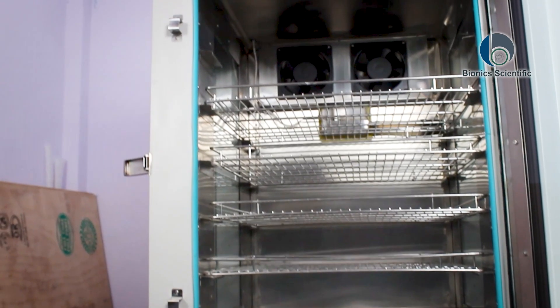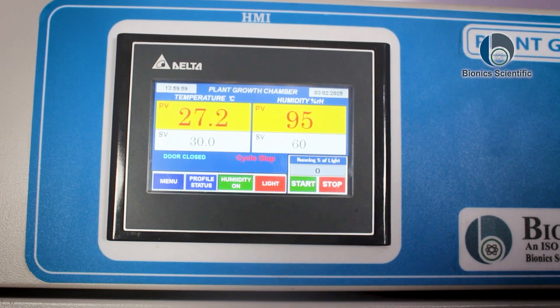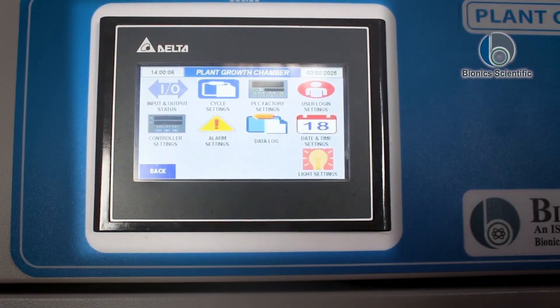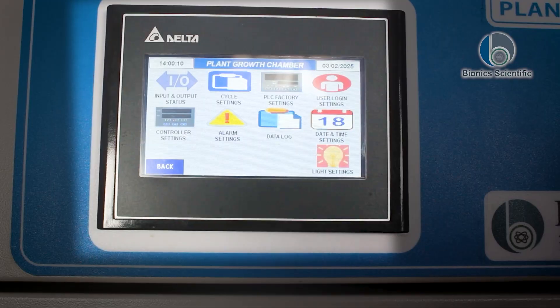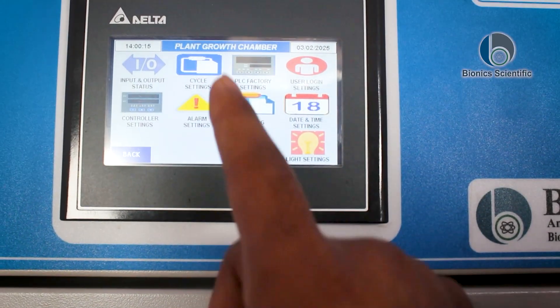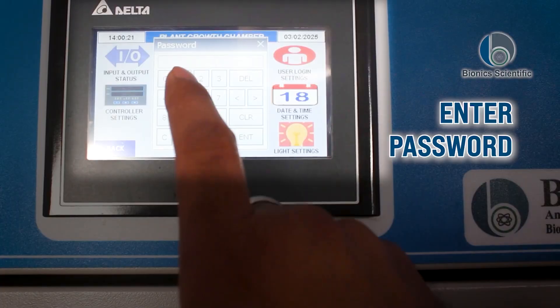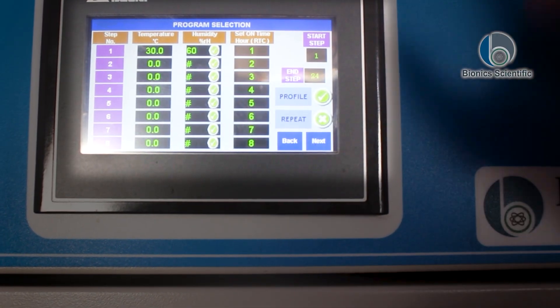There is one temperature sensor and five shelves available, out of which four are provided with the machine. For setting the temperature, I have stopped the cycle first. Now I'm going to tap on the cycle setting icon, as you can see over here. I'll press it and enter my password: one, two, three, four, then press enter.